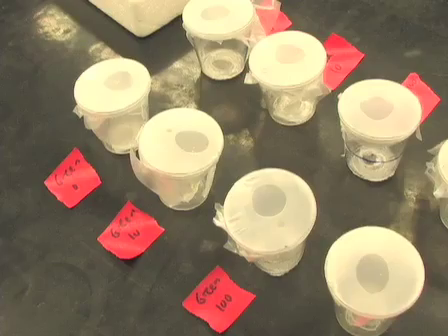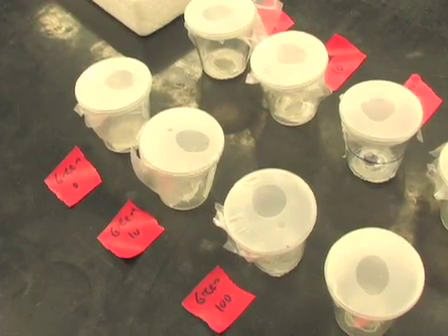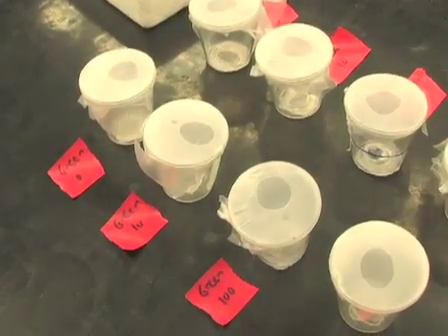So here we can look at the results from an experiment which I set up three days ago in the same way as the experiment that I've just demonstrated. I have one cup each of green and red aphids on zero micromolar, ten micromolar, one hundred micromolar, and one thousand micromolar or one millimolar nicotine diet.